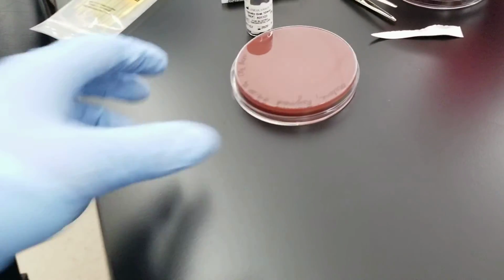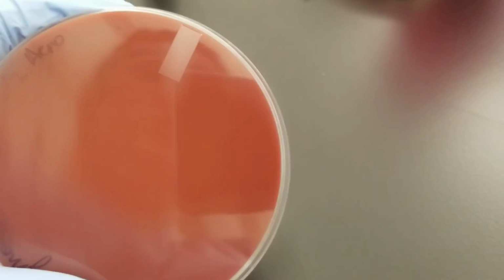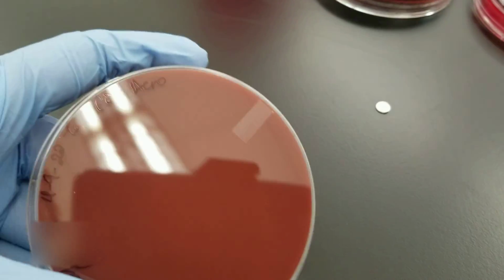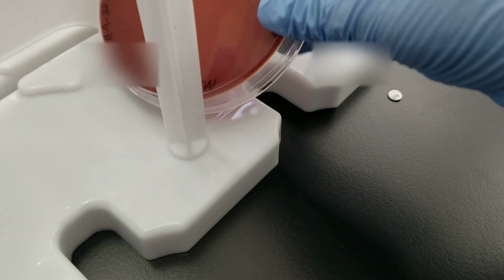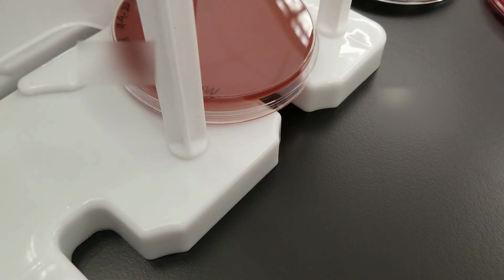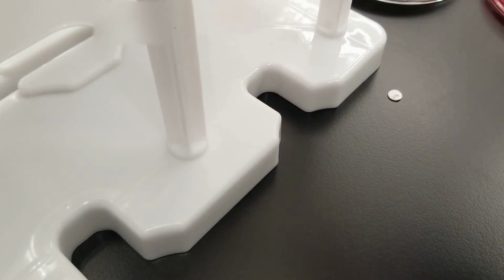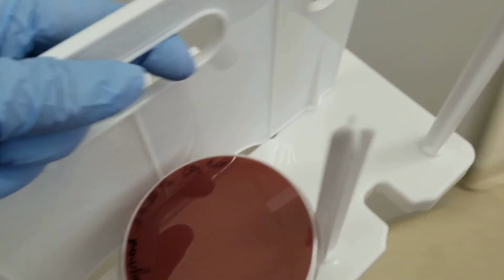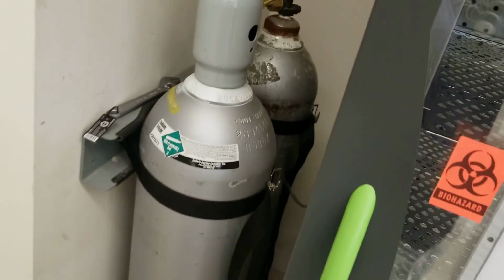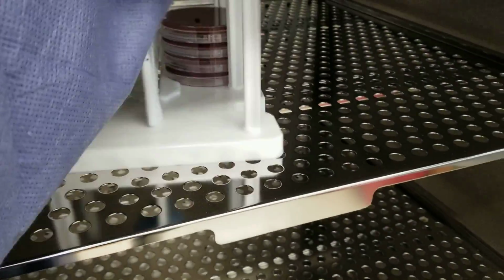And then with that CO2 plate, I'm going to put it into a holder with the original primary setup. Okay. So the original primary setup is going to go underneath of it. All right. And I'm going to put it into the CO2 incubator. Okay. Put it in there. I'll turn it on.